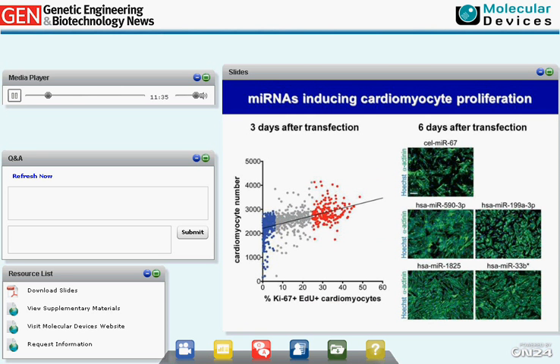Because we are looking at cell proliferation, one expects that if the cells proliferate more, we have to have more cells in the wells when we look at the wells. And this is indeed what we see. On the left-hand side, I'm showing you the results of the screening, where you can already appreciate a trend that the cells that proliferate more, the number of the cells is higher. But this is much more clear if we wait more time.